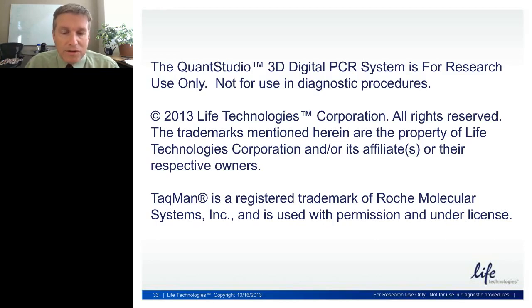What happens, though, with more and more amplification is that you increase the chances that the wild-type inhibition is going to stop, and you wind up picking up wild-type alleles. And in fact, we see that with the traditional mutation detection system that we have. You have to fine-tune where in the real-time cycle you draw the cutoff between the number of cycles necessary to detect the mutant and the number necessary to keep the wild-type background down.